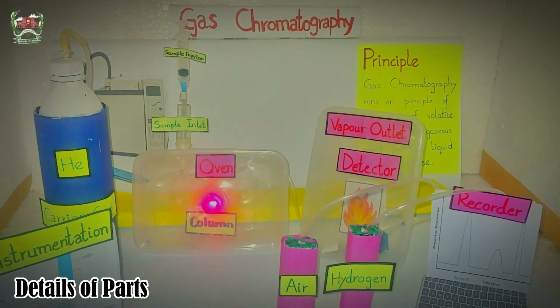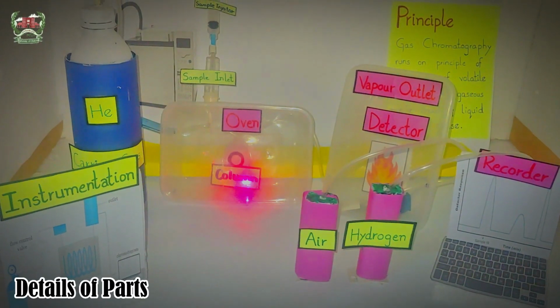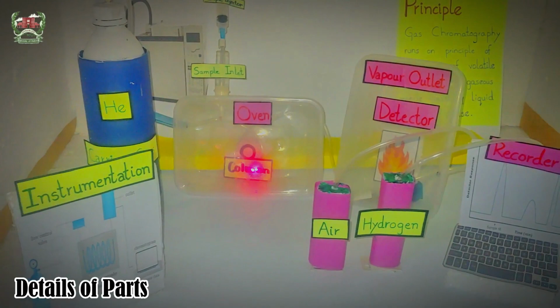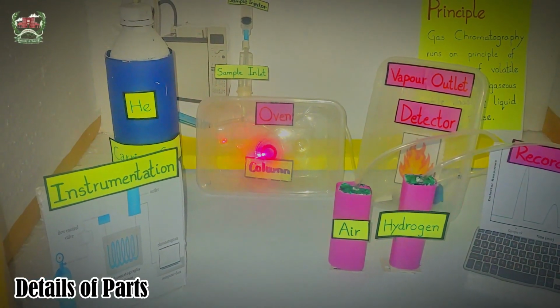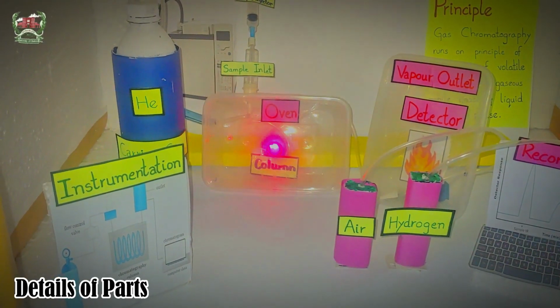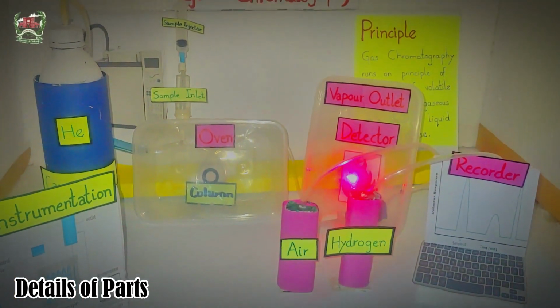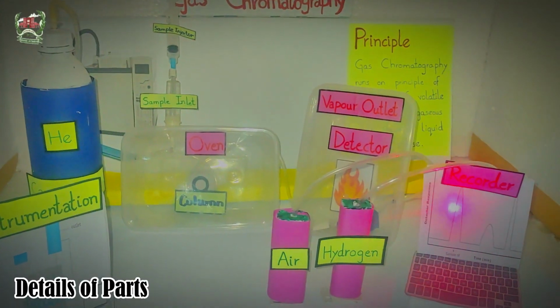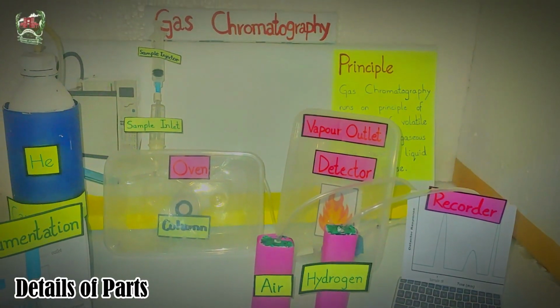So there are two major types of columns. The first one is a capillary column and the second one is a packed column. Generally capillary column is used in GC and length will be 1 to 300 meter. Internal wall of this capillary column is coated with high boiling point stationary phase. And this is the flame ionization detector, and this is the recorder. So here is the instrumentation of the gas chromatography.